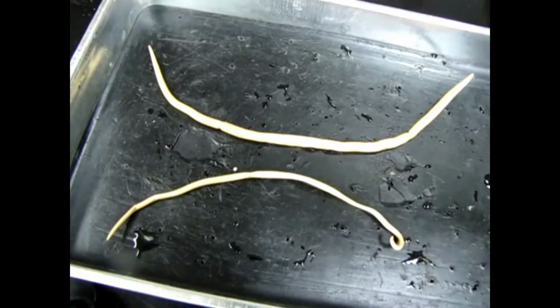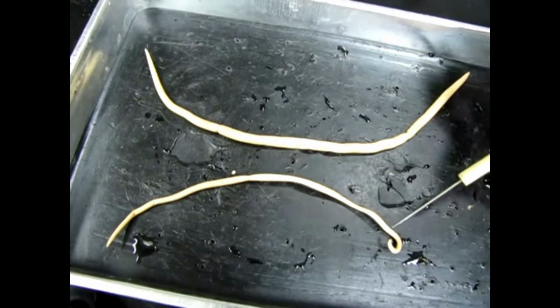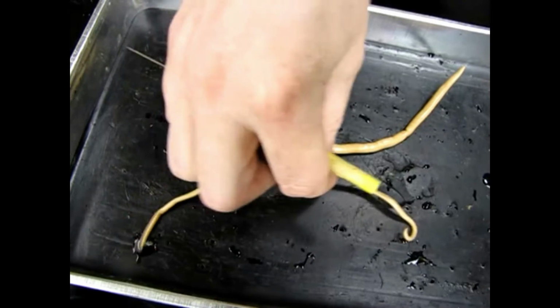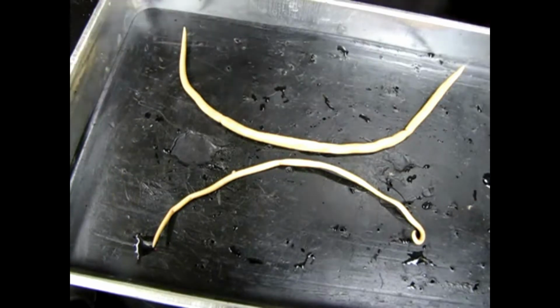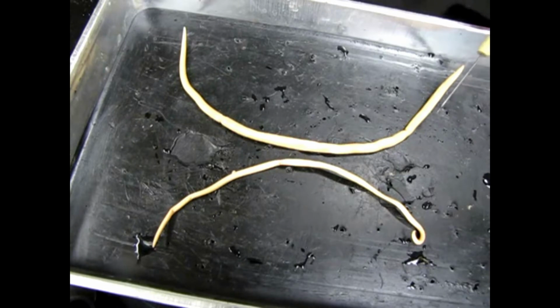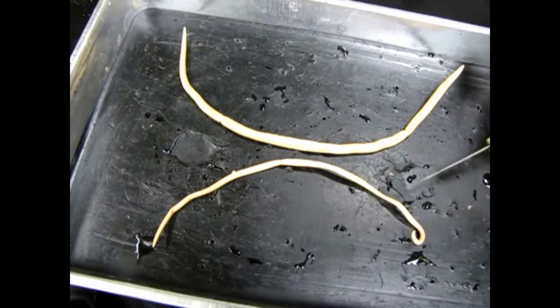So the size is one good indication of which is which. Another good external characteristic is, you'll note on the male here that the end is quite hooked. Okay, there's a hooked end. This is the posterior end of the animal, so the anus is located down here, making this the anterior end. And this hook is involved in copulation. It's used to grasp the female, and also there's a pair of small spines, copulatory spicules, which are used to transfer sperm to the female.